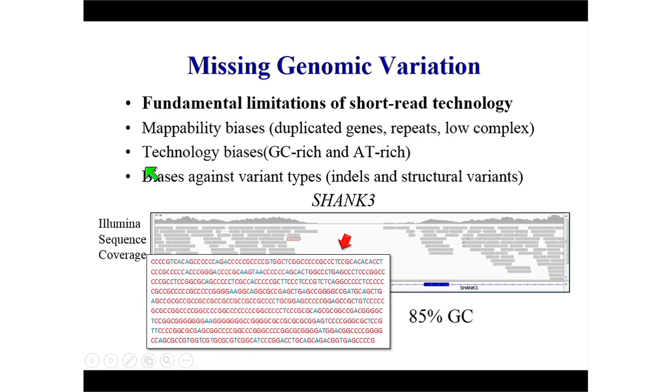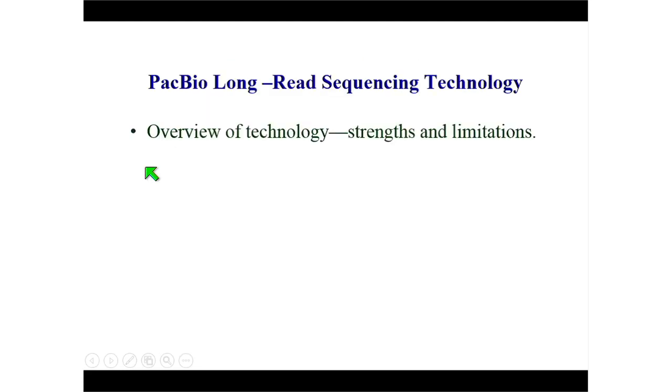And the reason for that, not a surprise, is that it's made up almost entirely of G's and C's. So this is a particularly onerous example where, no matter how much we sequence, we can't really get high coverage over those areas.